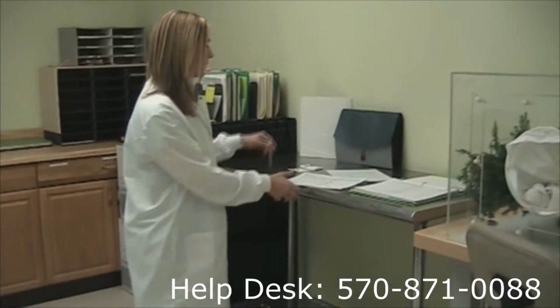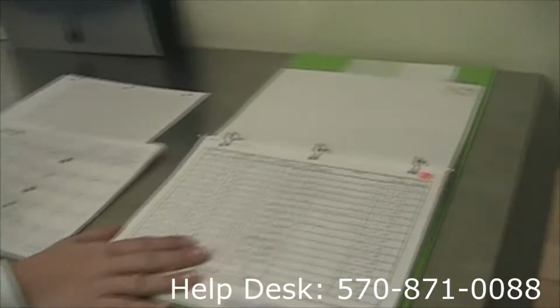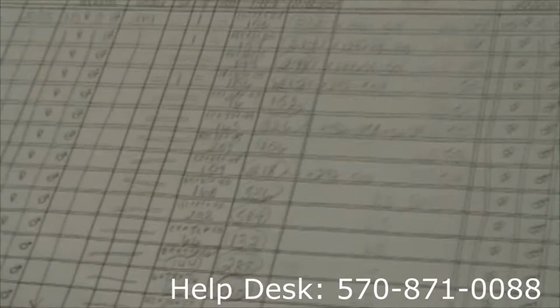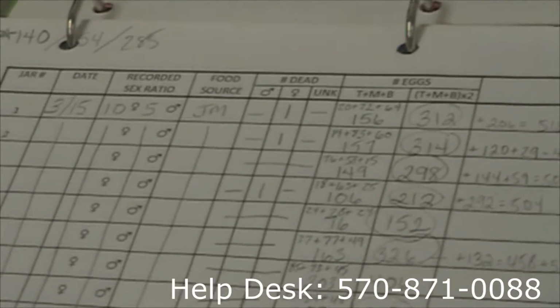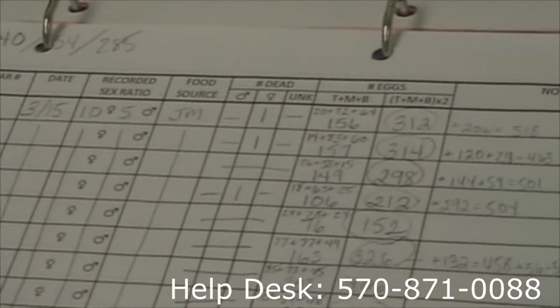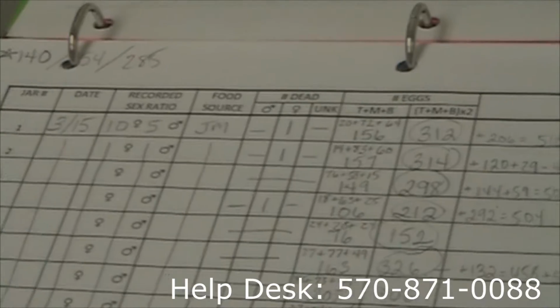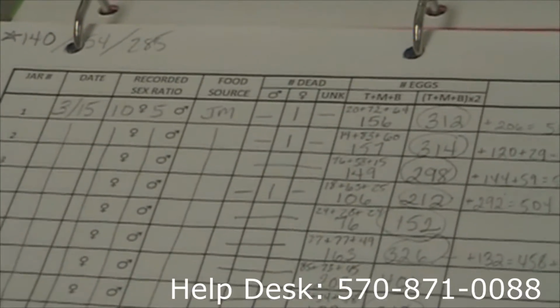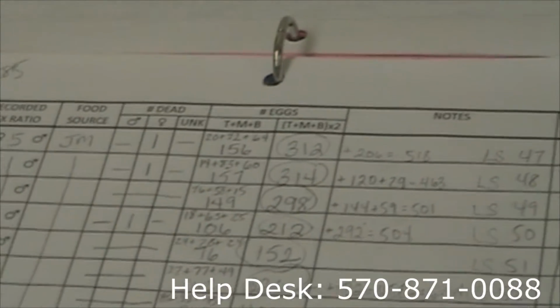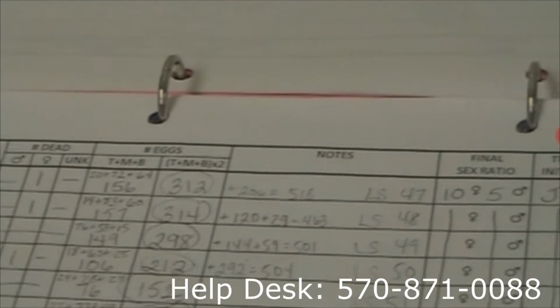So just to give a brief idea here, these are our schedules and our egg sheets. Once we start our ovipositioning jars, which will keep track of our male and females and what kind of eggs they produce, this is what we can expect to see in the beginning. We'll have our date and our recorded sex ratio. We always have 10 female and 5 male per jar. We get a different amount of dead per week, which usually we try to keep low, obviously. So we keep track of which ones had a problem, and we can go back and retrace what could have caused a death in the jar.